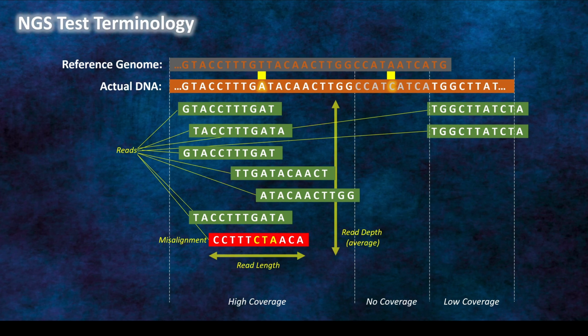And then you've got one area of low coverage where you only have a couple of reads. And that's actually, in our example, has even expanded into an area where the reference genome doesn't cover. The reference genome doesn't cover 100% of our DNA yet. There are still gaps, particularly on the Y chromosome. There's an important gap. But even on other chromosomes, it's not 100% coverage. There's point something of gaps that still remain. And so sometimes you'll get reads over an area that the reference genome doesn't have a representative set of actual base pair values for.